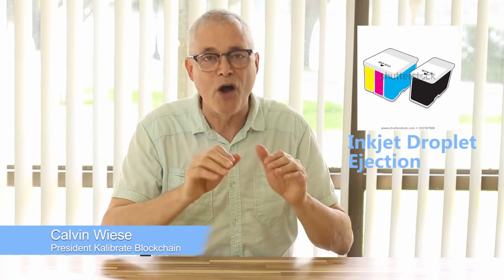Droplets in the picoliter and even femtoliter scale can be uniformly ejected with high spatial resolution. The technology and expertise for deployment is reasonably accessible. It has become clear to us that with this technology, the solution almost writes itself.